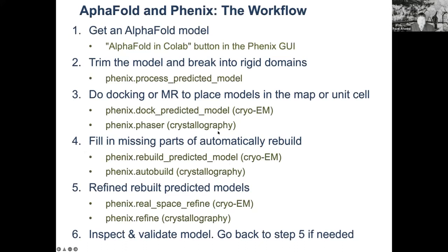You just have to realize that predicted models are not going to be 100% complete or 100% accurate. So you still need to do some work to fill in missing bits and parts of that model. Again, we have 2 tools to do that, one for cryo-EM and the other for crystallography. It's all available in the latest Phenix versions. Once you've completed your model, you go to refinement.